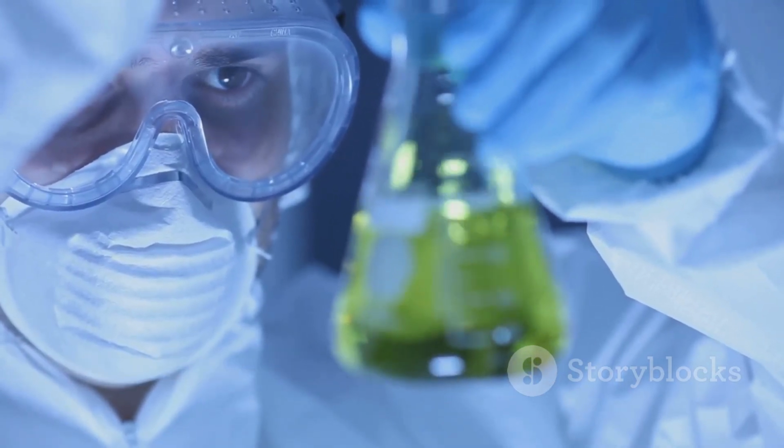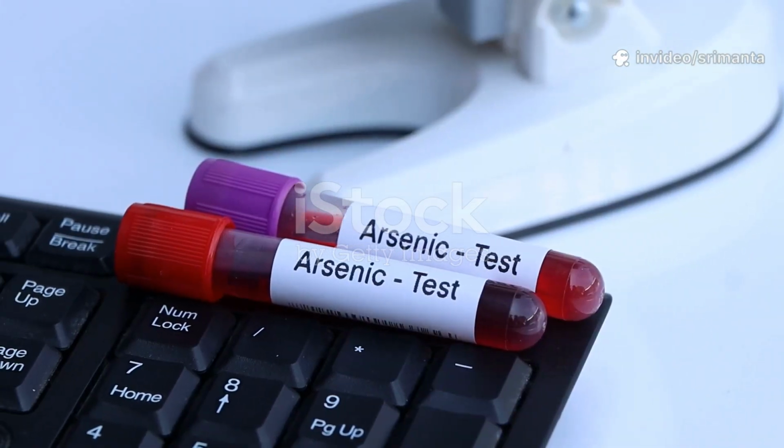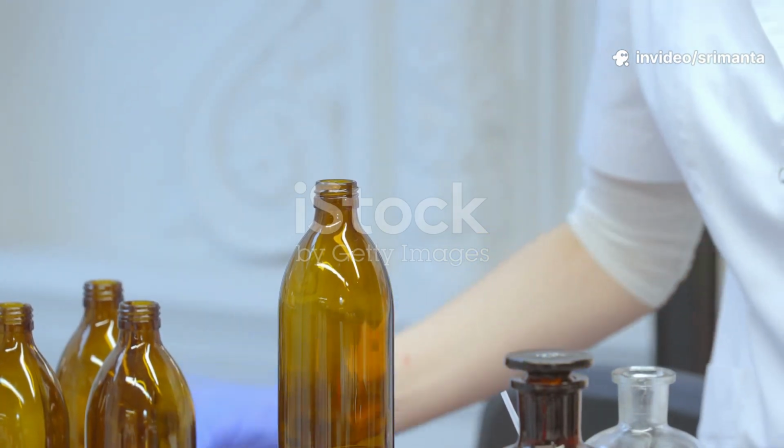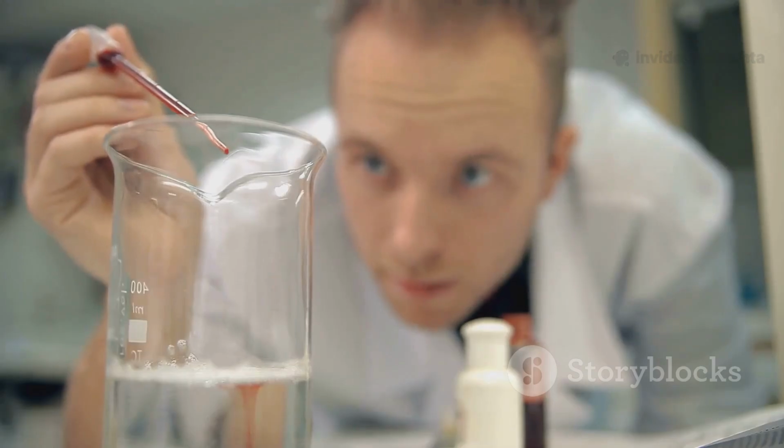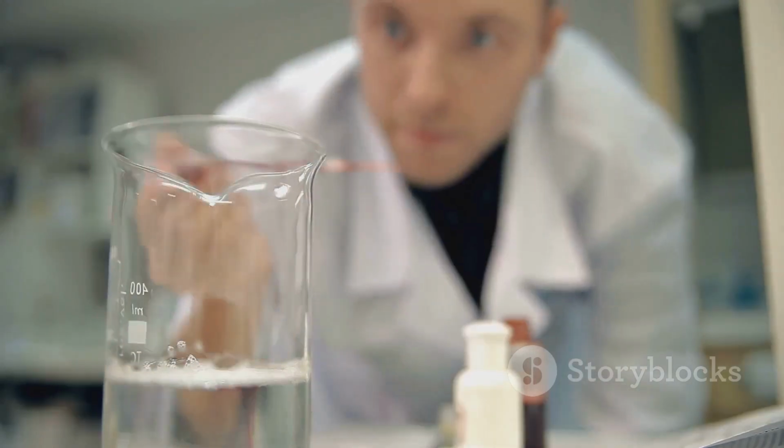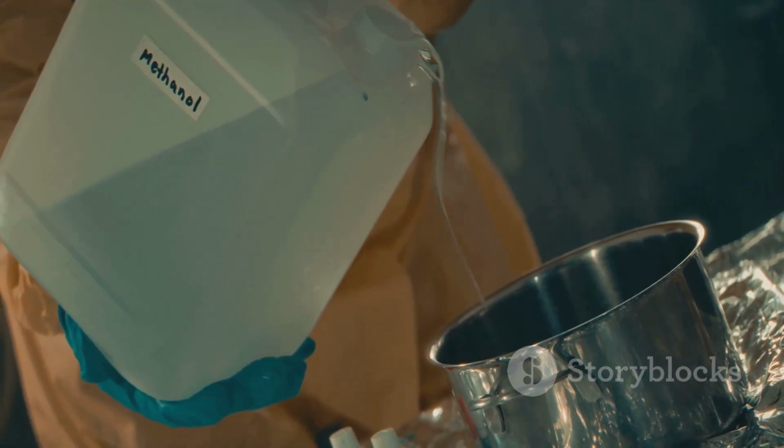So, how do we run the actual test? It is a tale of 2 bottles. First, we prepare the test solution. We take a specific amount of the substance we want to check for arsenic and dissolve it in water or a suitable acid inside one of the Gutzeit bottles. Then we add the other necessary chemicals.